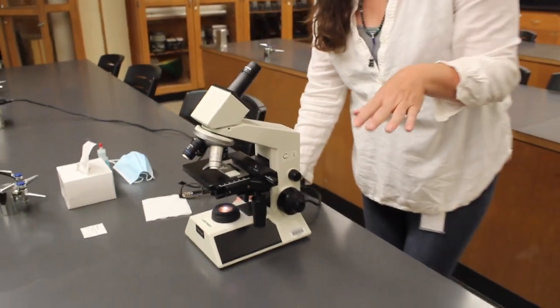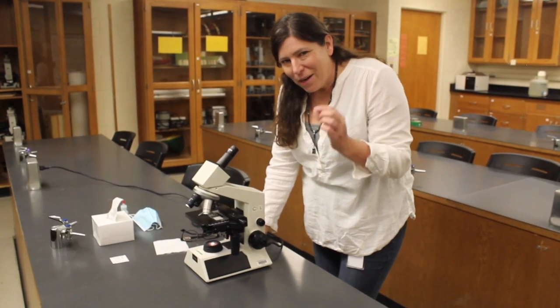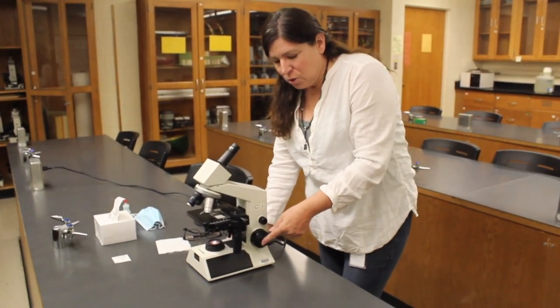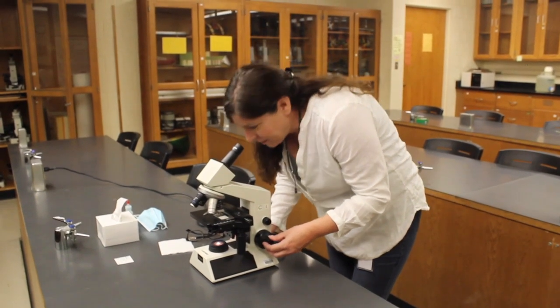It's also in pretty good focus. Using that trick really helps. But it's not perfect, and I want it to be perfect. So I'm going to use the fine focus now to get that letter E in very crisp. This is what it looks like when you get it in focus. As you slowly turn the fine focus, the image gets sharper and sharper until it's in focus.